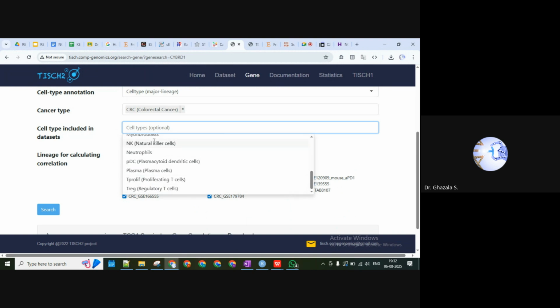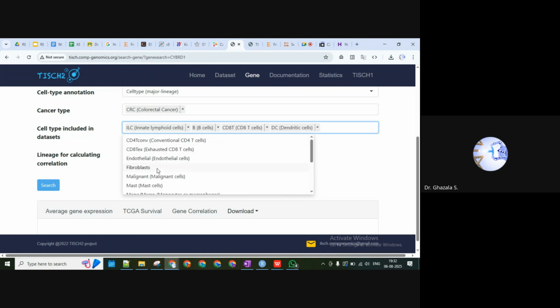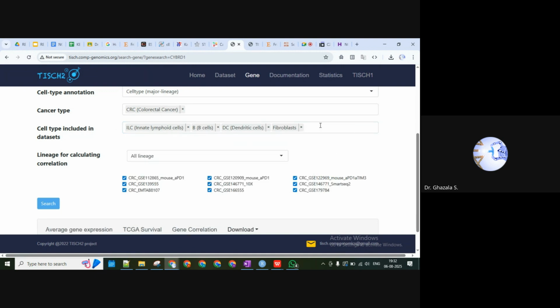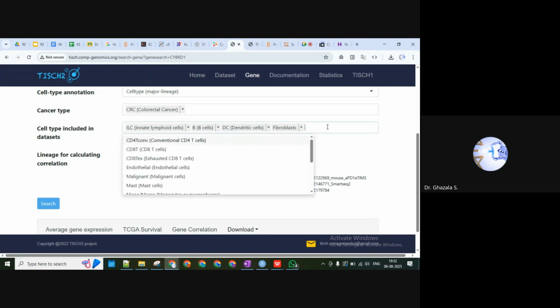Okay, but still we need to differentiate or exclude those cell types which are tumor suppressing, or even promoting cell types, depending on the objective of the study. That's totally up to us. We can also select multiple cell types. For example, we just saw that the CD8 T cell is working in suppressing cancer. But we are interested in promoting cancer, or which cells are supporting the progression. So we will try to remove that from the list. And if you are not selecting any, then it will consider whatever list is given.